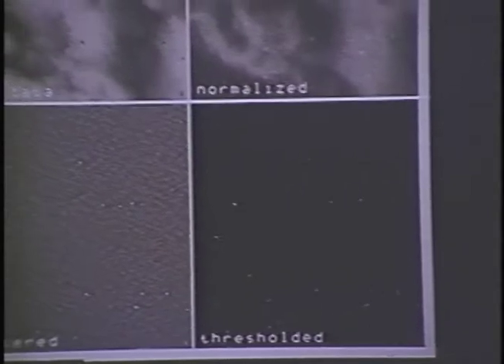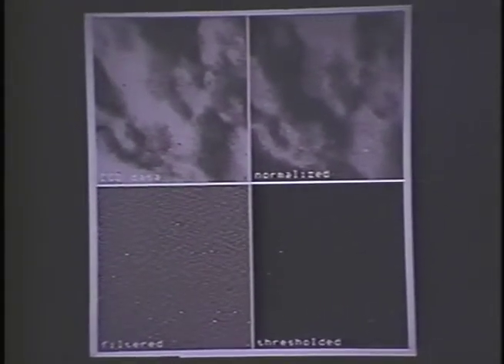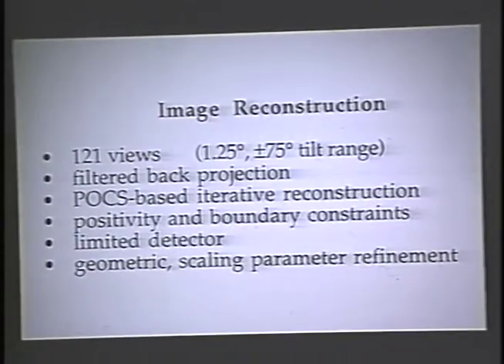So all the rest of the chromosomes sort of go away, and we're left with these bright spots, which we can then develop a technique which recognizes and prunes the list based on the size of the particles, since we know what the gold beads are. What this does is it allows us to automatically recognize the gold beads, even up to when specimens are at very high tilt, where the amount of plastic you're looking through becomes very, very thick. Again, that gives rise to a considerable savings in human time.